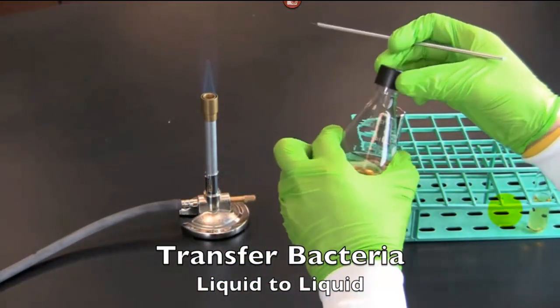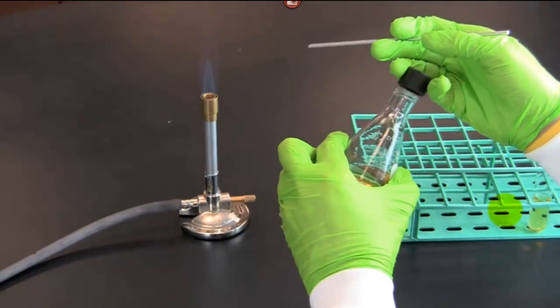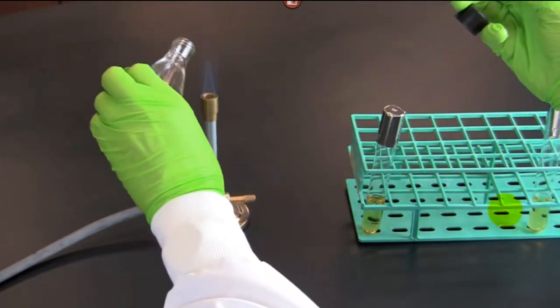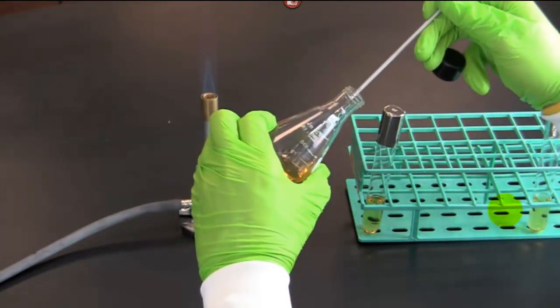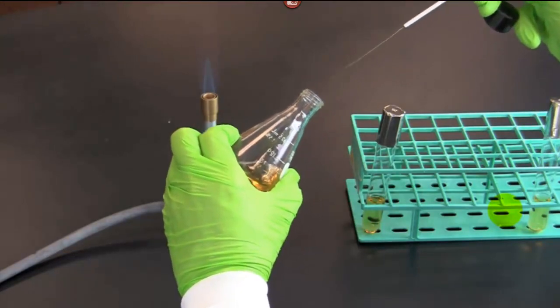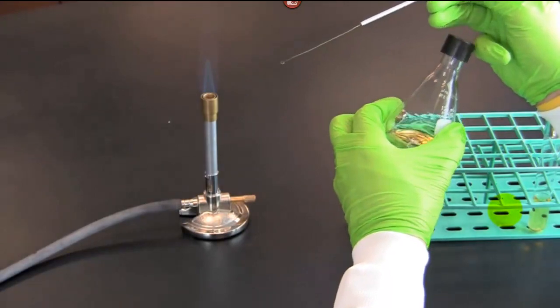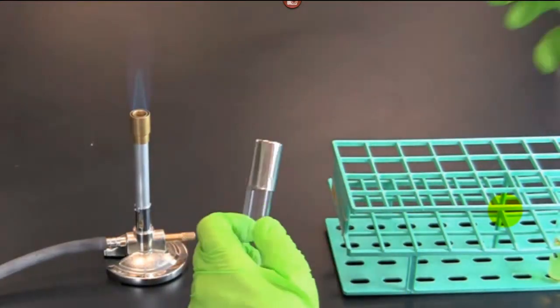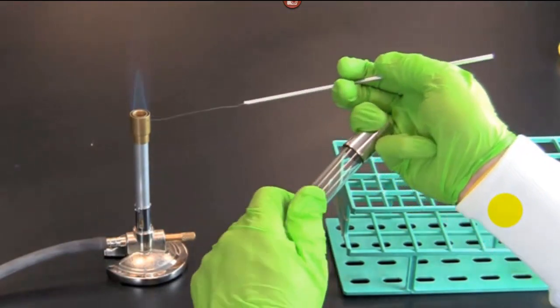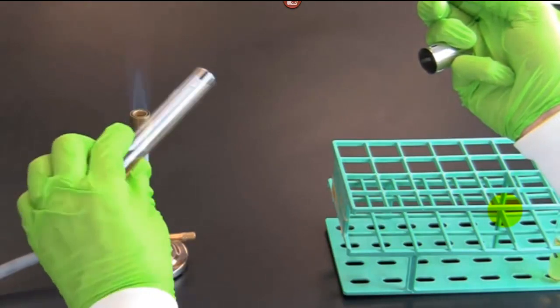Okay, liquid to a liquid. Here we go. So he sterilized his loop. He is now going to hold that. He's going to heat the barrel, kill any contaminants that could possibly be on the rim and prevent that from escaping. He's now getting some liquid on the end of the inoculating loop. He's going to set that down. Now he's going to pick up another, and boy, pretty chrome test tube lid. We don't have that. Oh, it just slides off. Anyway, he's now heating that.